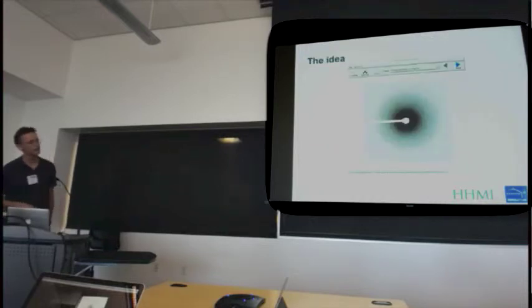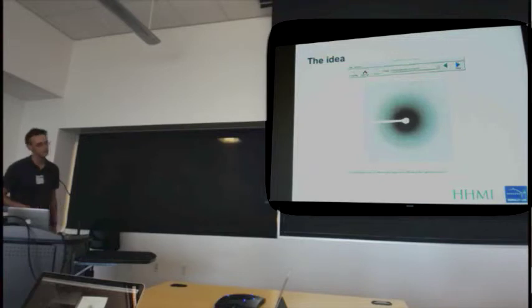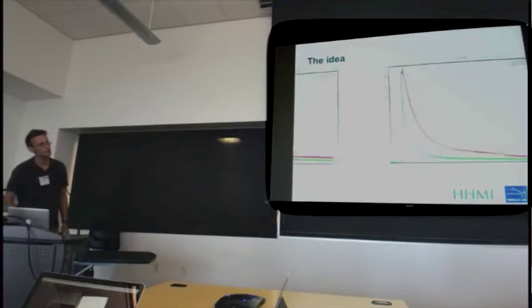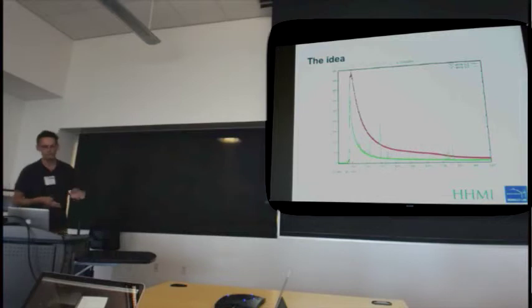And just to outline that, the way that works is, here is a diffraction image. Now, if we assume that the beam center is somewhere here, somewhere off the center, and then we look at the average and the variance in rings around that trial beam center, then if we're very far off, we see something like this. We put the average intensity in those rings in red, the variation in green. If, on the other hand, we're looking at the correct beam center, or we're close to the beam center, then those distributions look something like that. Now, the idea is that we can construct a target function out of that, so that starting from some initial guess of the beam center, it works its way towards the correct beam center. So those issues can be detected and corrected for.